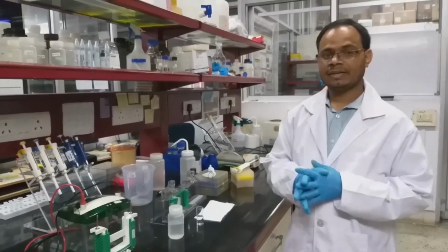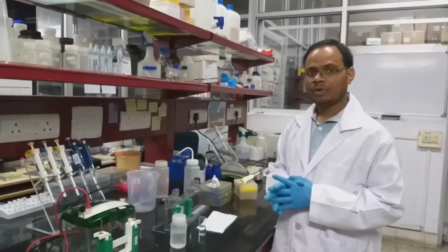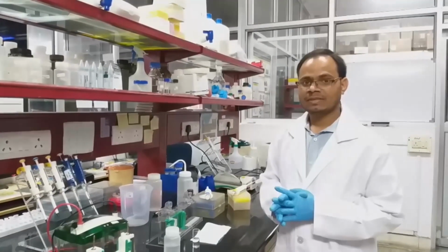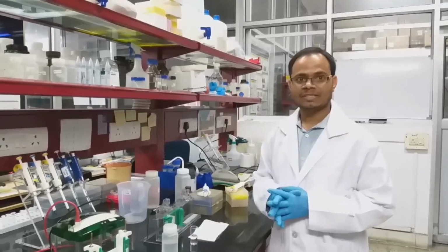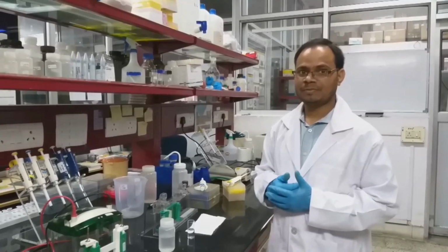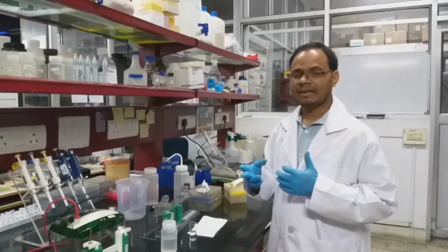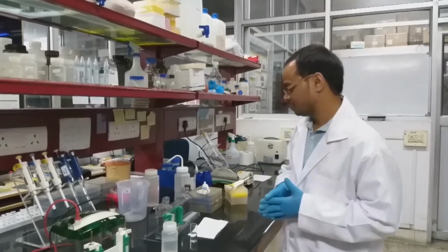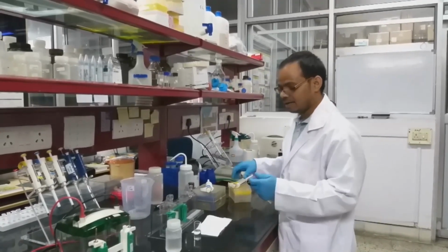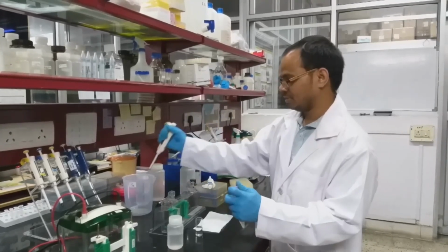The other important thing is 10% ammonium persulfate. Ammonium persulfate, which is catalyzed by the TEMED, provides free radical species which accelerate the forming of a mesh-like shape in acrylamide gel. Like it will catalyze forming the mesh. So this is the 10% APS. I just add 100 microliter of 10% APS to resolving gel.